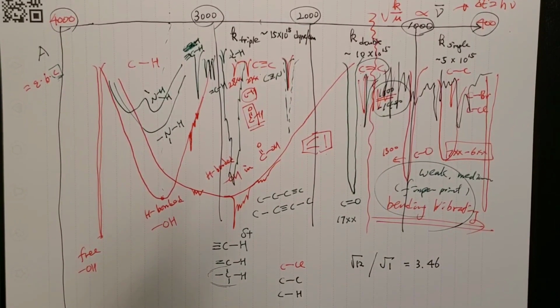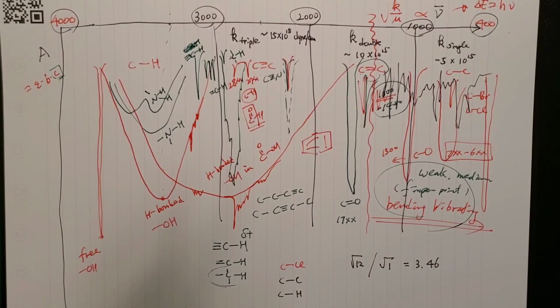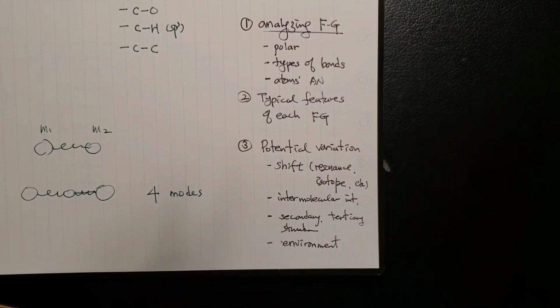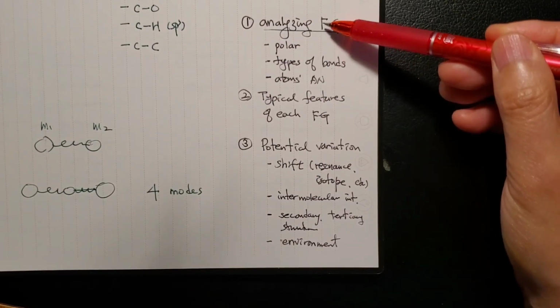All right, I ended up making this longer than I thought, but I had to do it because I didn't want to split it. But next and last, probably, for IR spectroscopy, I'll deal with some advanced features, like when you have some variations. Let me search. Yeah, like I showed on this slide, we did this, right?